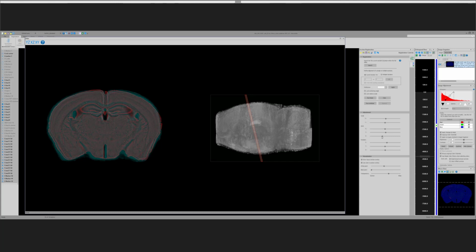And also I need to shift back a little to make the hippocampus the right size. Now going back, the optic tracts are fairly close. So this is just to visualize the plane through the Allen space. What we're trying to do is find a plane that best matches the experimental section itself.